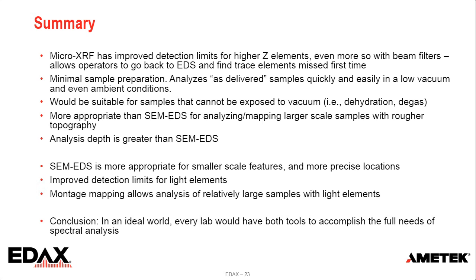Next question is, does Micro-XRF detect ppm level elements? Yes, it does. Micro-XRF can do single-digit ppm level analysis.